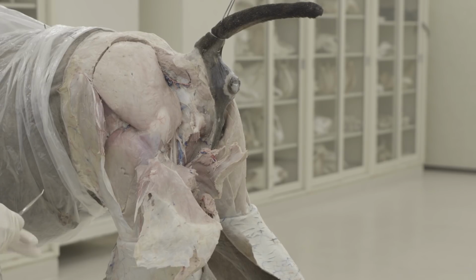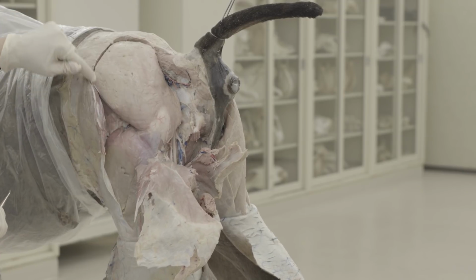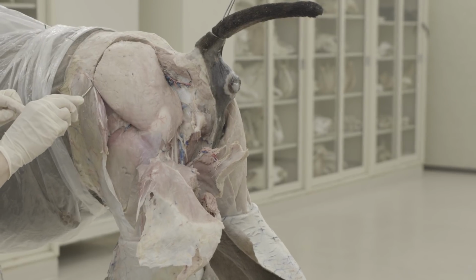The next muscle is a pretty massive muscle in the pony. It's this middle gluteal, and it takes up a lot of space. So when you're cutting through it, be sure you're getting all the way through the muscle because it is very thick. So this whole thing is middle gluteal.